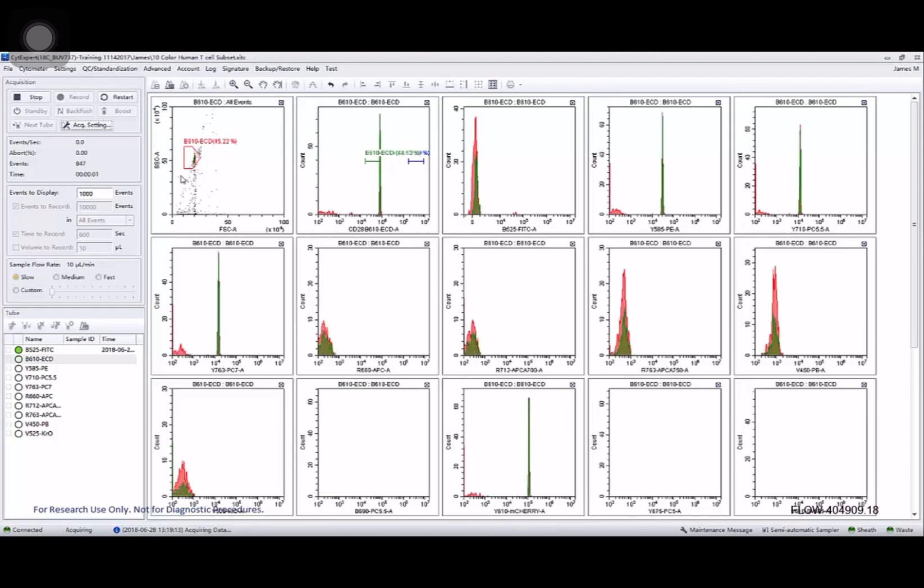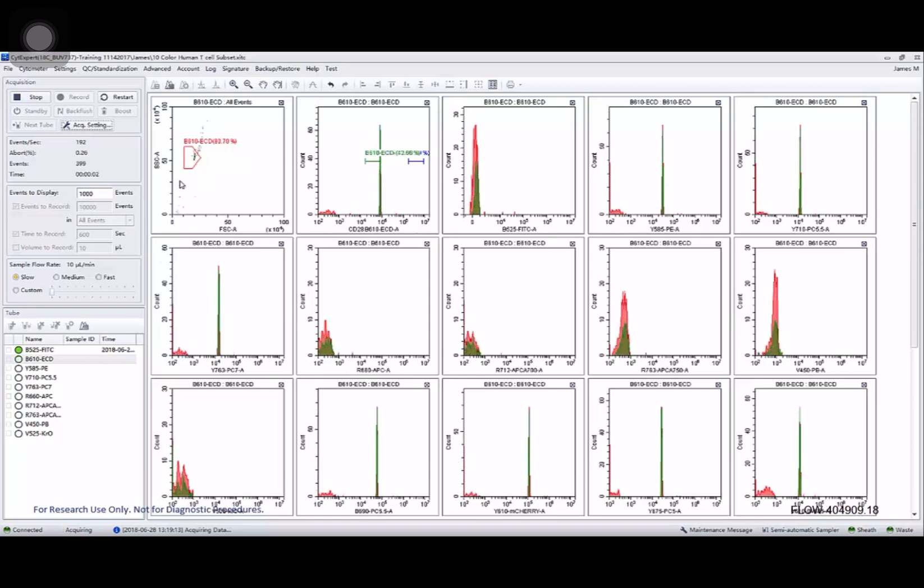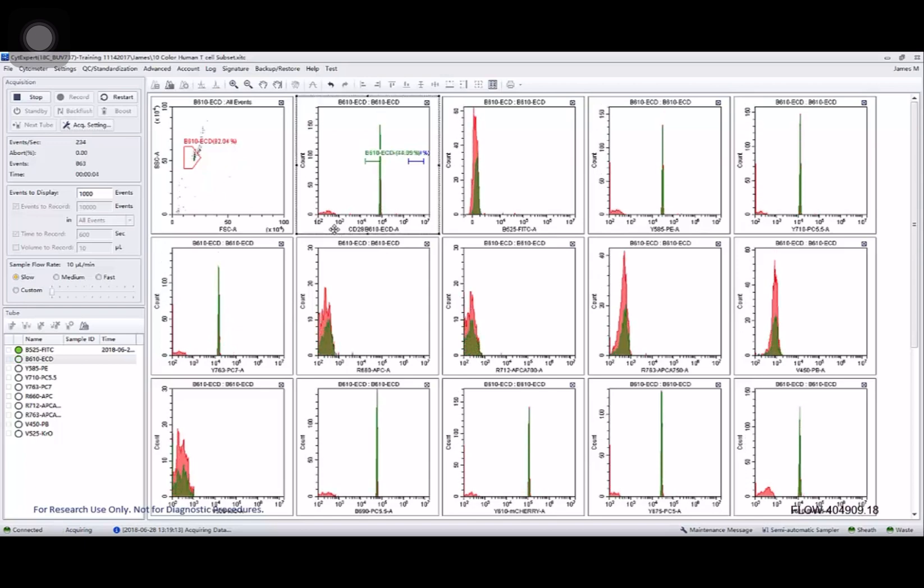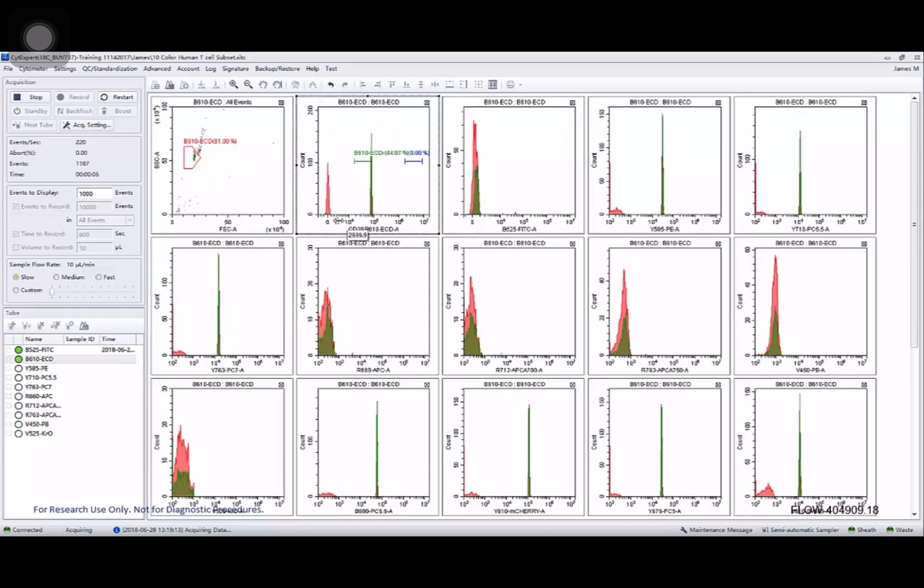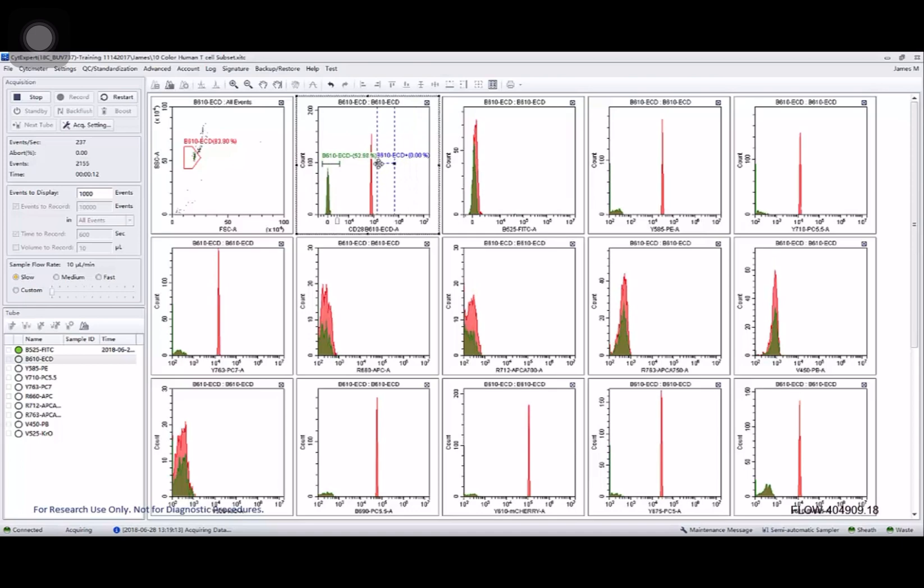The same thing happens again. Make sure my singlet bead population is on there. Use my lin log slider so that I can see both my negative and positive populations and move the gates to contain them.